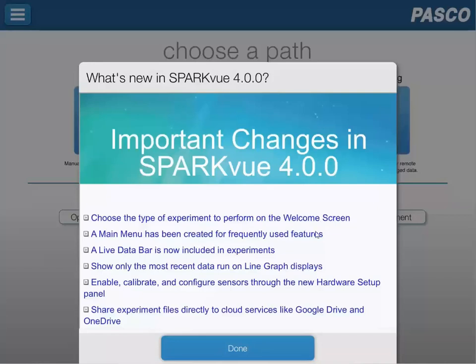This splash screen will show up the first time, however it can be accessed again after closing it down the first time.